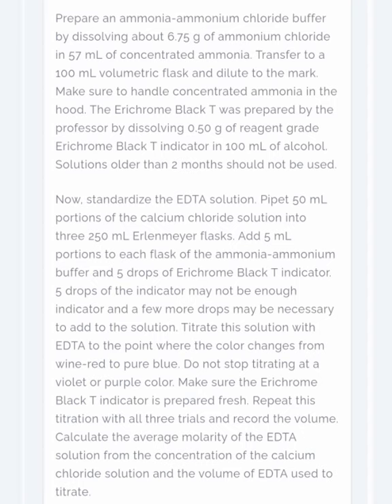Prepare an ammonia ammonium chloride buffer. This buffer is used for maintaining the pH which is required to make this reaction possible. The given steps have been demonstrated in the above image.